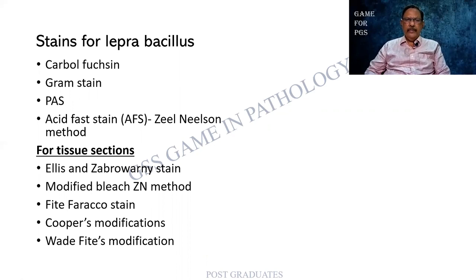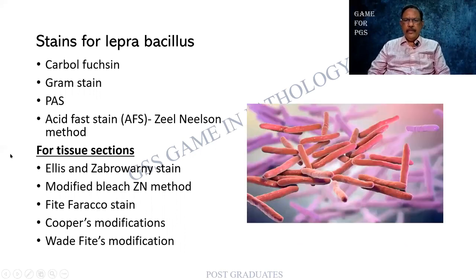Cooper's modification, who was the author of the picture that I showed first, and Wade-Fite's modification of their own stain. Like this, there are panels and panels of staining methods. Obviously, a lot of research has been done on the leprosy bacillus for a lot of reasons. Until today, we have not been able to eradicate leprosy. So this is the structure. I would like you to appreciate the rounded ends of the bacillus.